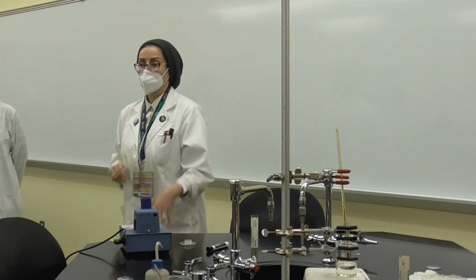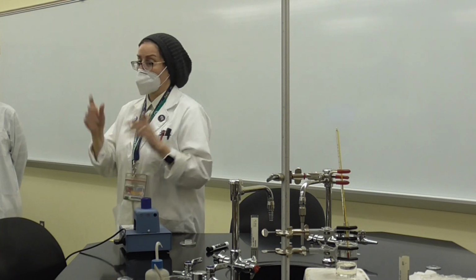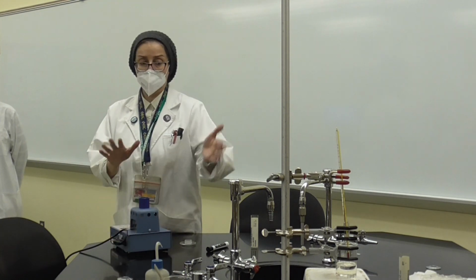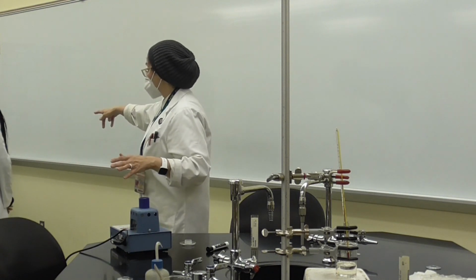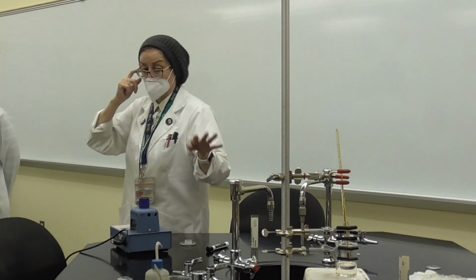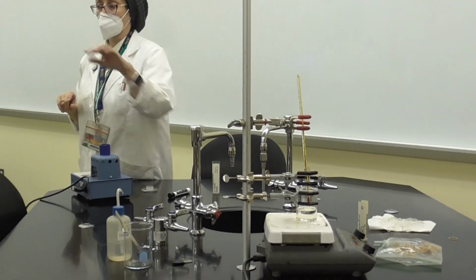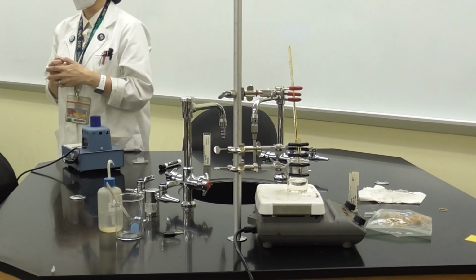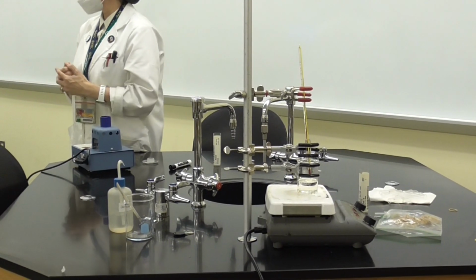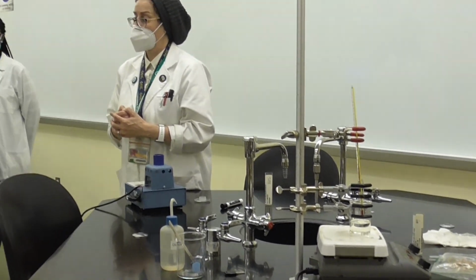Do you have any questions for me? All right, now I want you to have this set up the same way. We do have all the apparatus over there. We have the hot plate. We have the mineral oil and the beaker. For every single table, you have all the glassware that you're going to need for your experiment today. All right? Thank you.